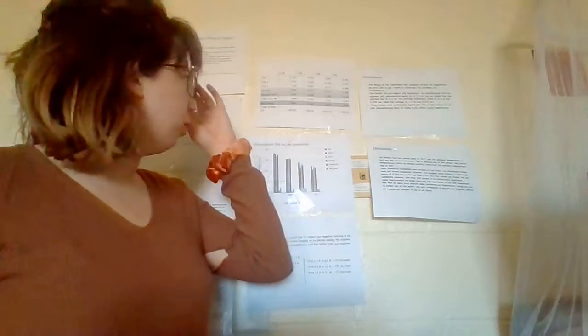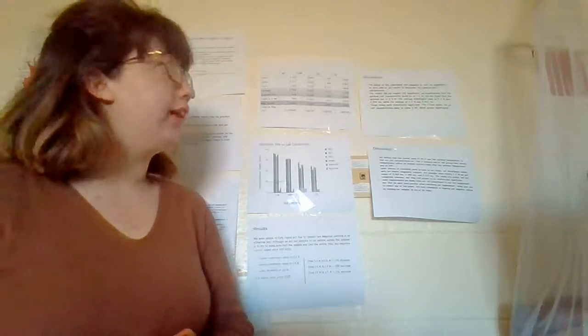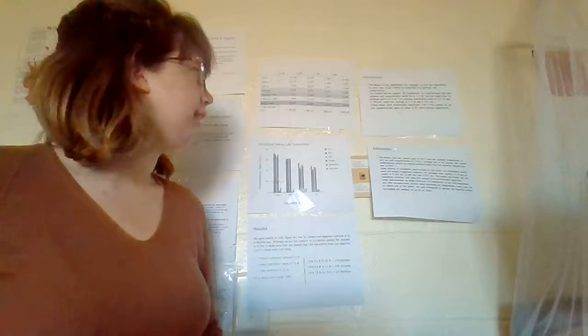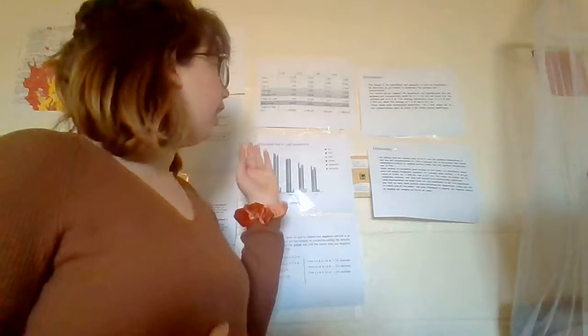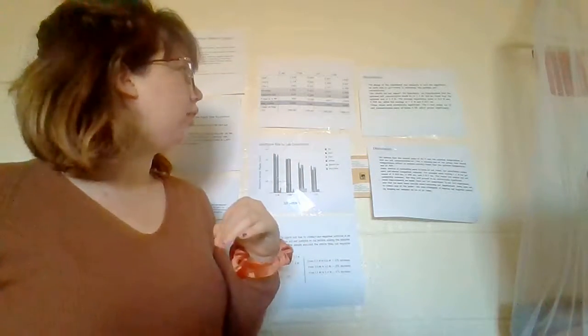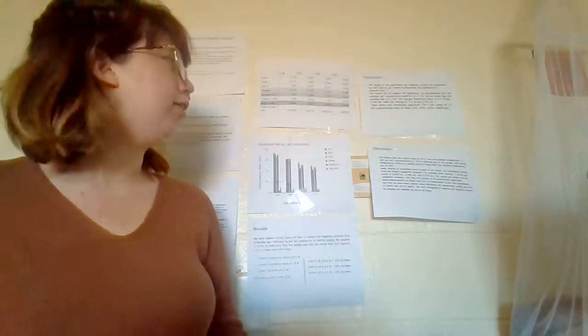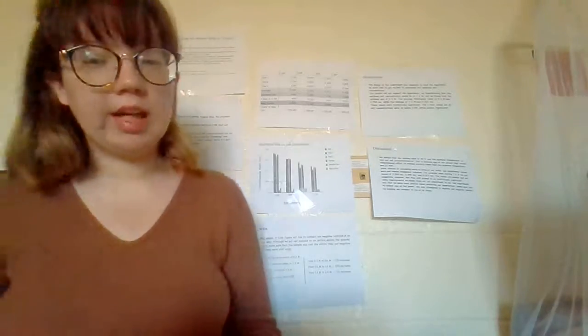And our negative controls, as I said earlier, were a little bit high. We got 0.099, 0.067, 0.067, and 0.051. So they're very high compared to the other groups. And then our negative control values versus our t-test, they're very, very low. They're all negative times 10 to the negative 6, times 10 to the negative 7. So we got very low t-test, which shows that our negative controls are statistically significant.